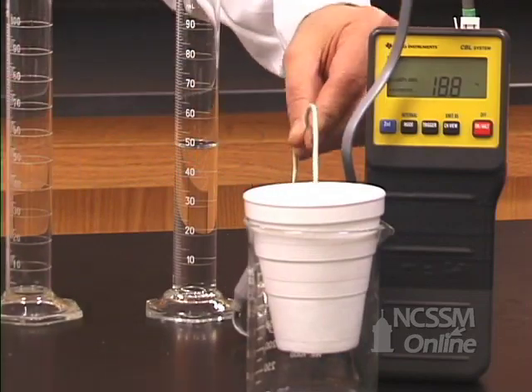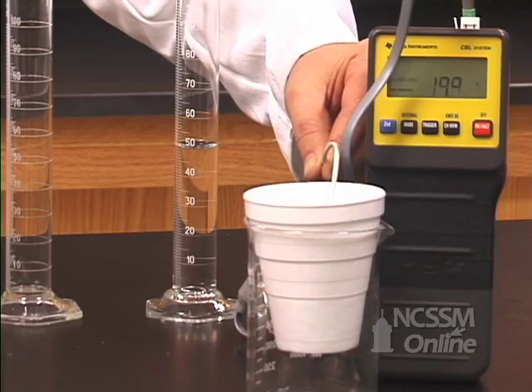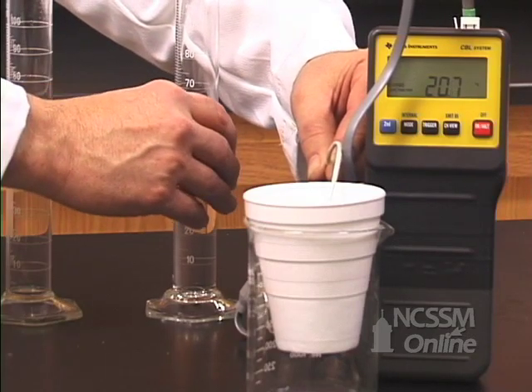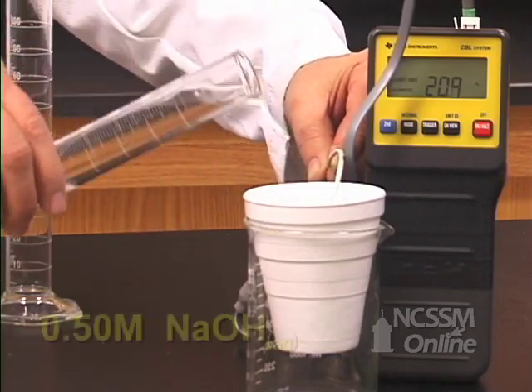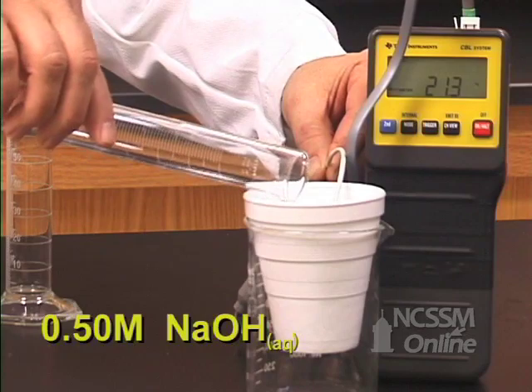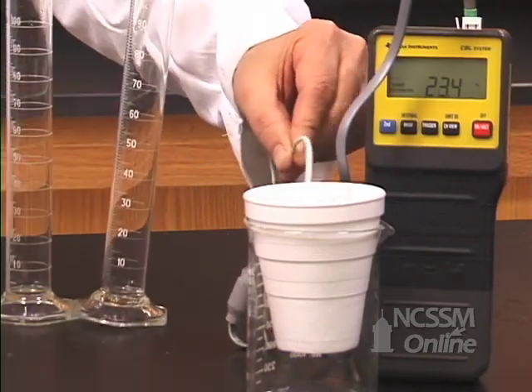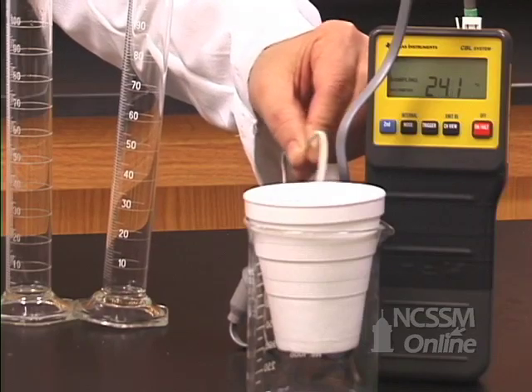We put our temperature probe into the calorimeter and measure the initial temperature of the solution. We add the sodium hydroxide solution and stir the mixture and record the highest temperature reached.